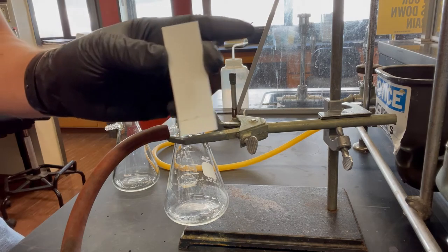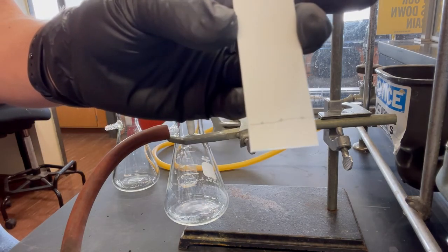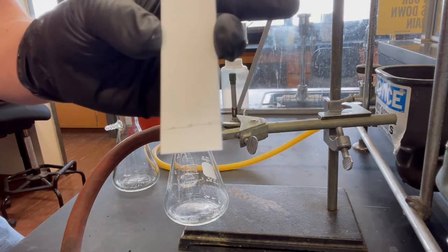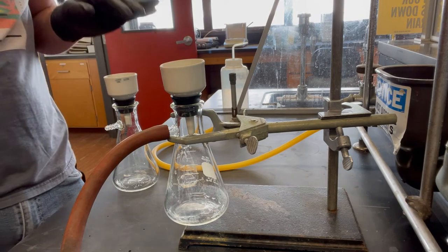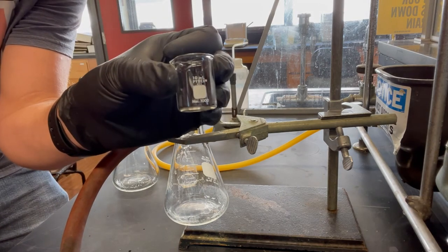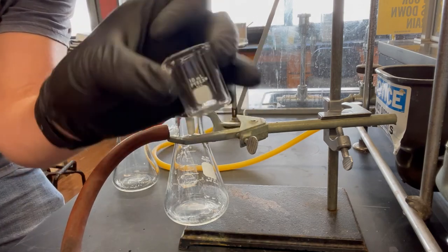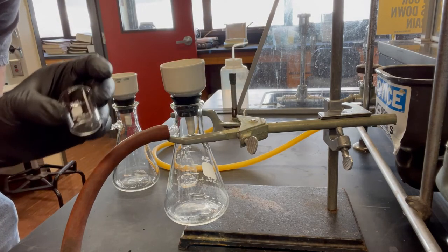Basically I'm just going to add my fourth spot on here. I'm gonna spot the two filtrates on here, and then I'll gather a little sample of these and place them inside of this adorable little 10 milliliter beaker. I'm gonna do one in here and then the other sample in another beaker.